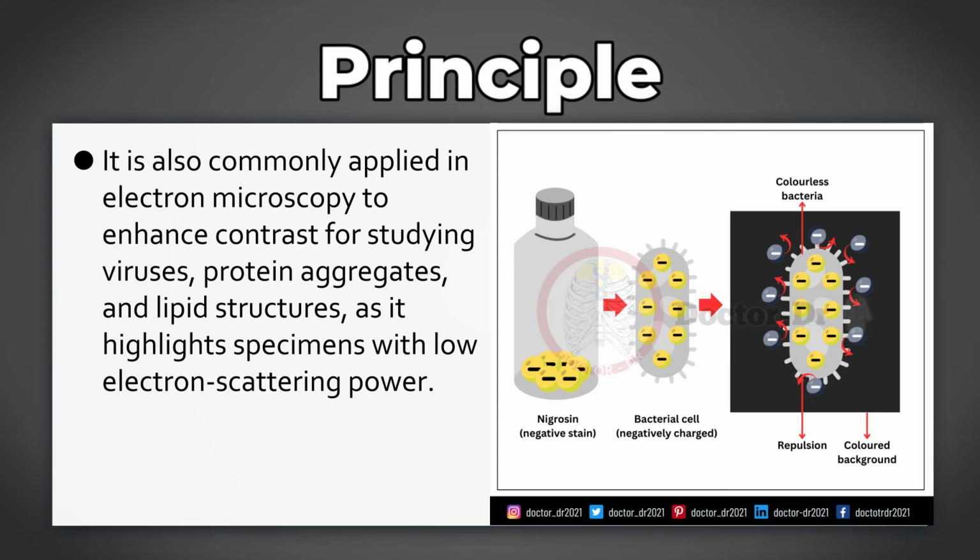It is also commonly applied in electron microscopy to enhance contrast for studying viruses, protein aggregates, and lipid structures, as it highlights specimens with low electron scattering power.